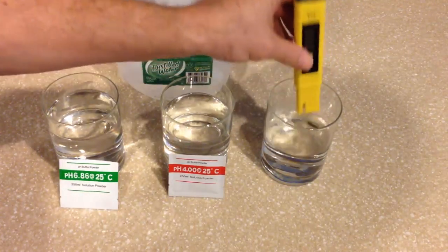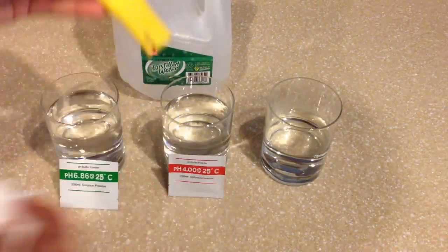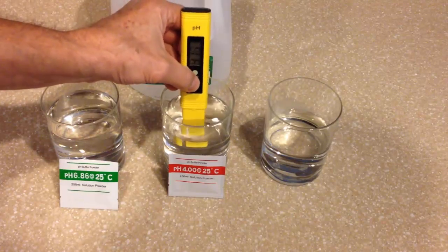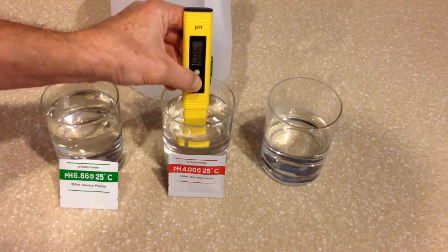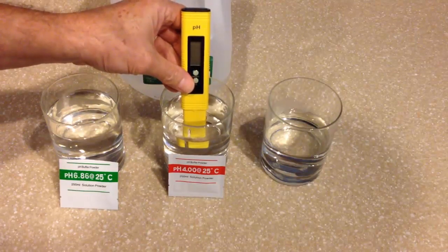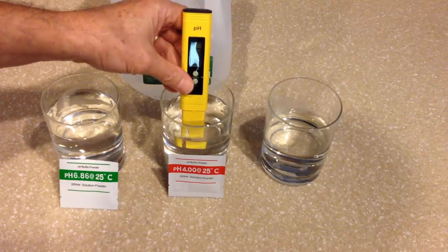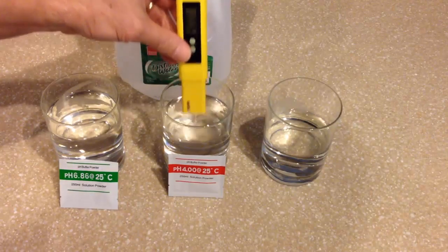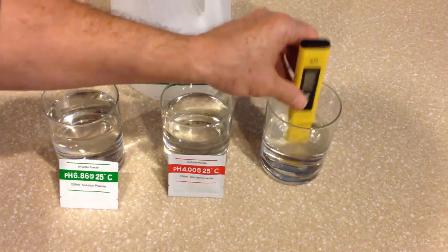I'm going to rinse it off in the distilled water, dry it off a little bit, then simply put it back into the 4.0 solution. Again, I'm going to press the calibration button for three seconds, release, and then press it one more time and it'll start to flash at 4.0. When it stops flashing, it'll be completely calibrated, and there it stopped at 3.99, as you can probably see. I'm simply going to rinse it off, and it's completely done.